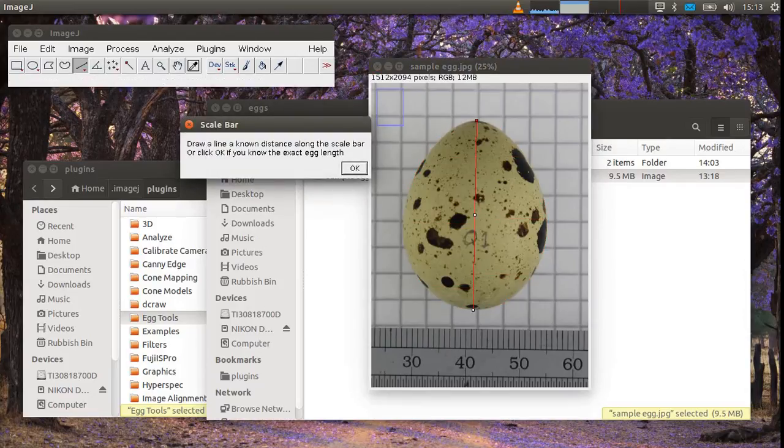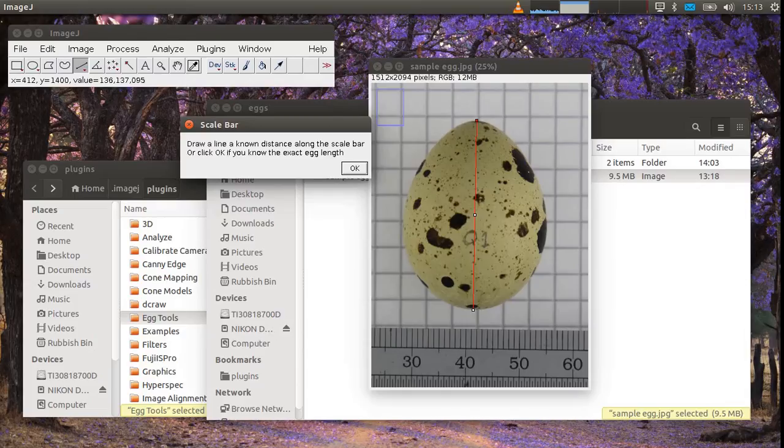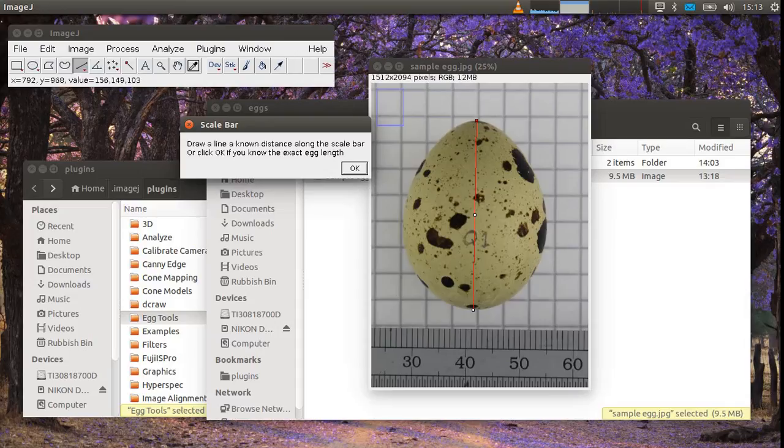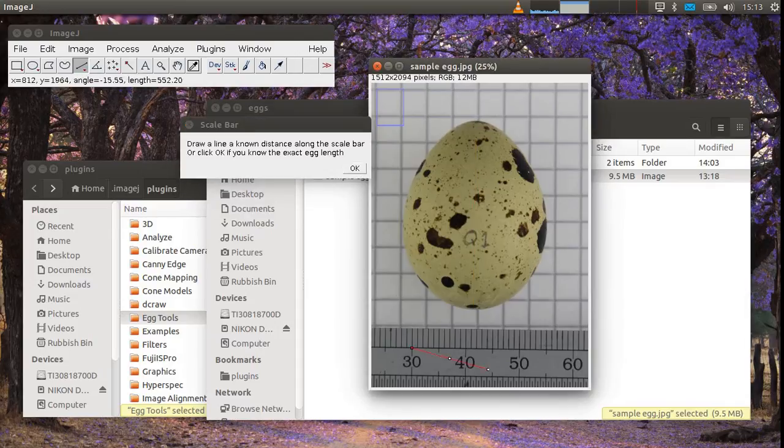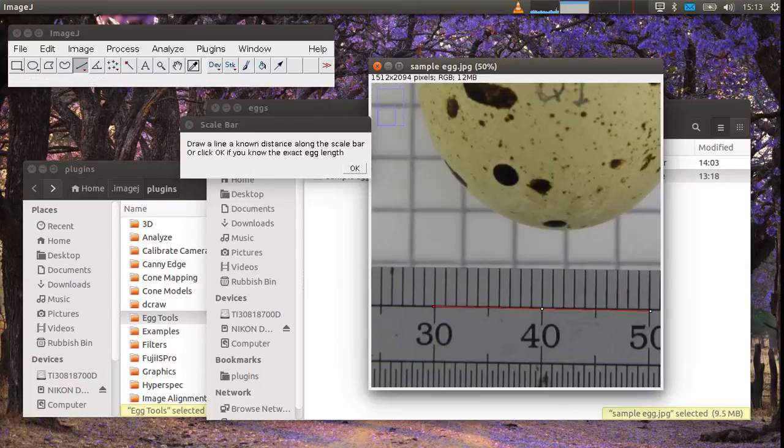Now if there's a scale bar in the image this is the point where you draw a line along the scale bar. However if you only know the length of the egg and there's no scale bar in the image just press OK here and it will use this line automatically drawn along the length of the egg. But we do have a scale bar here and I don't know the length of the egg. So I'm going to draw along the ruler here.